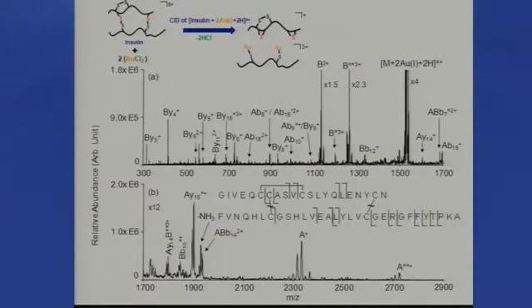So here's an example. If we take the 6-plus ion of insulin and react it twice with gold(I) chloride anion, this is a sequential reaction. We can put two golds into the insulin, and when you do that and activate it, the biggest products that you get out are the separated chains.